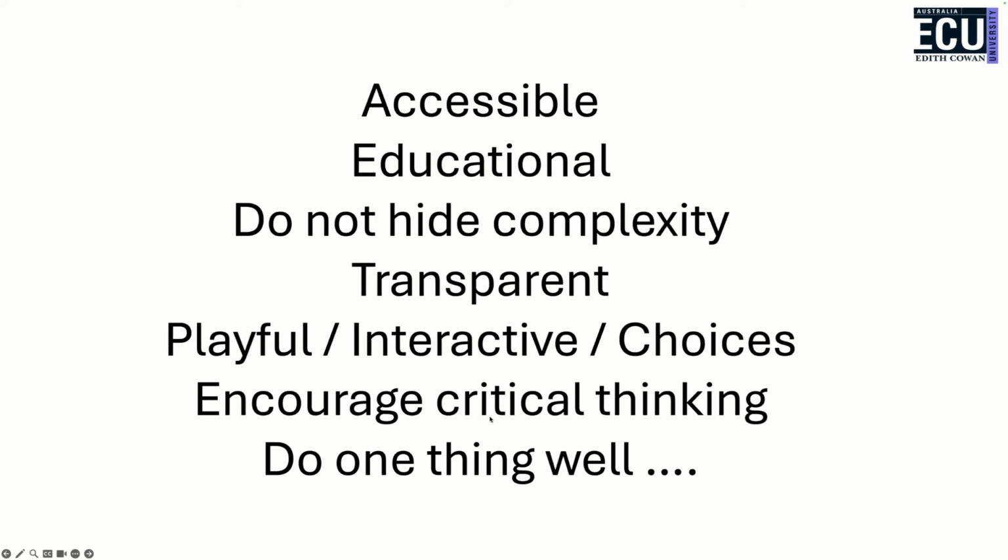This in turn will hopefully encourage people to develop their critical thinking abilities, particularly in this space of quality control, and really focus on trying to do one thing well rather than doing lots of things fairly maybe not so well, or one thing well and everything else really badly.